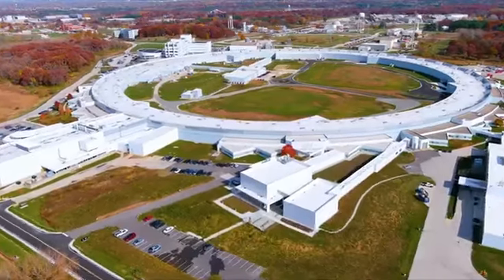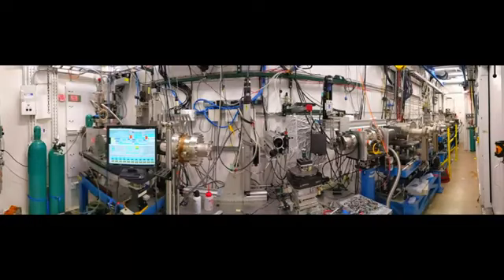To understand solidification and more broadly processing of materials, we leverage state-of-the-art characterization approaches, namely 3D imaging techniques at both the synchrotron as well as our own lab. And we use these techniques to obtain a holistic perspective on the microstructures and to understand where this microstructure comes from in 3D space and in time.